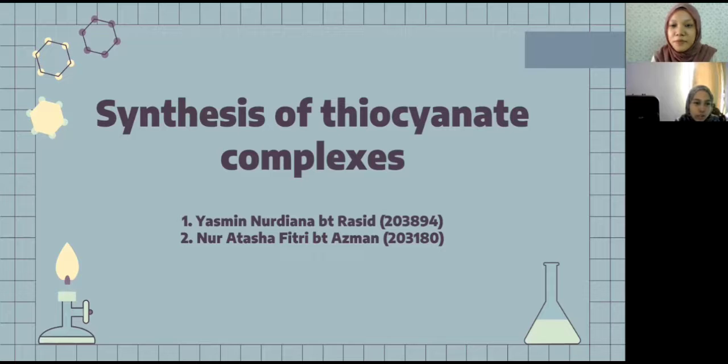Today we are going to present an experiment. The title is Synthesis of Thiocyanate Complexes. Before we go any further, let us introduce ourselves.